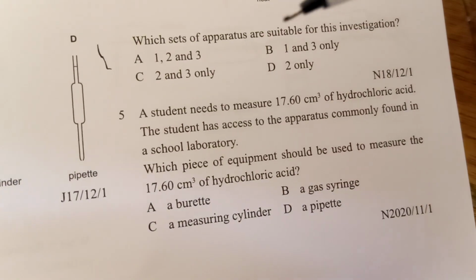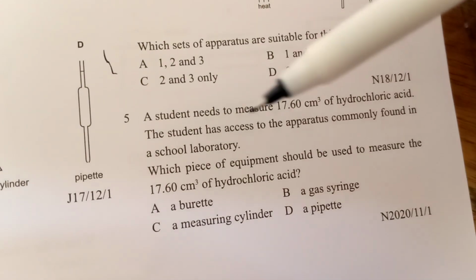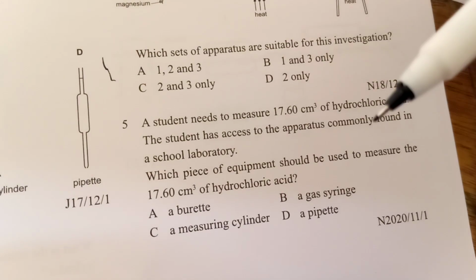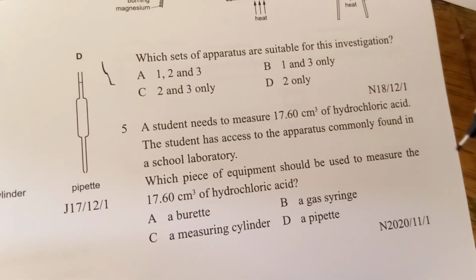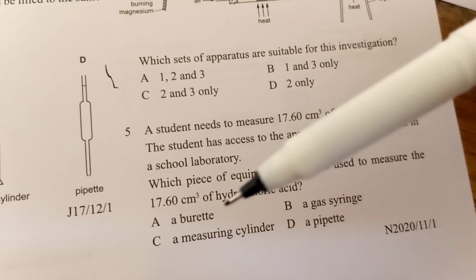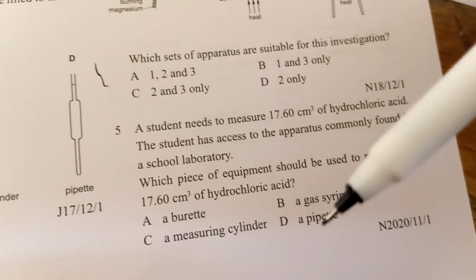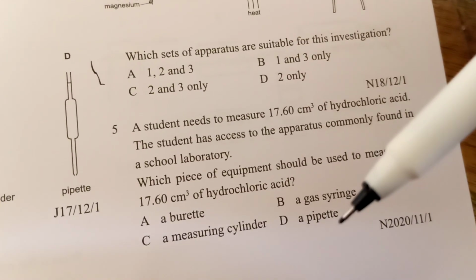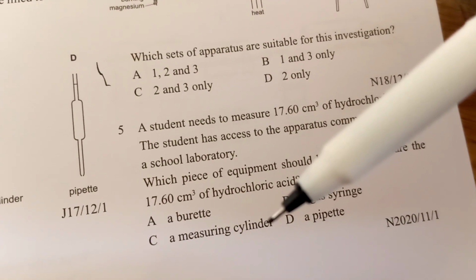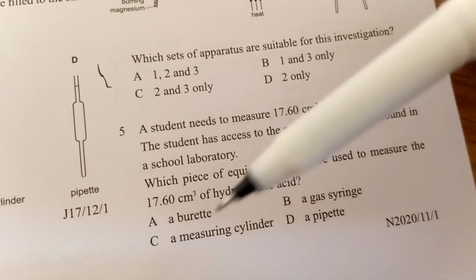A student needs to measure 17.6 cm³ of hydrochloric acid. Choose from equipment commonly found in the school lab, which piece of equipment should be used to measure 17.6? Now we use a burette. A gas syringe is not good. A pipette you use for a fixed volume of liquid. A measuring cylinder is not precise. Okay, not precise measurement. So we use a burette.